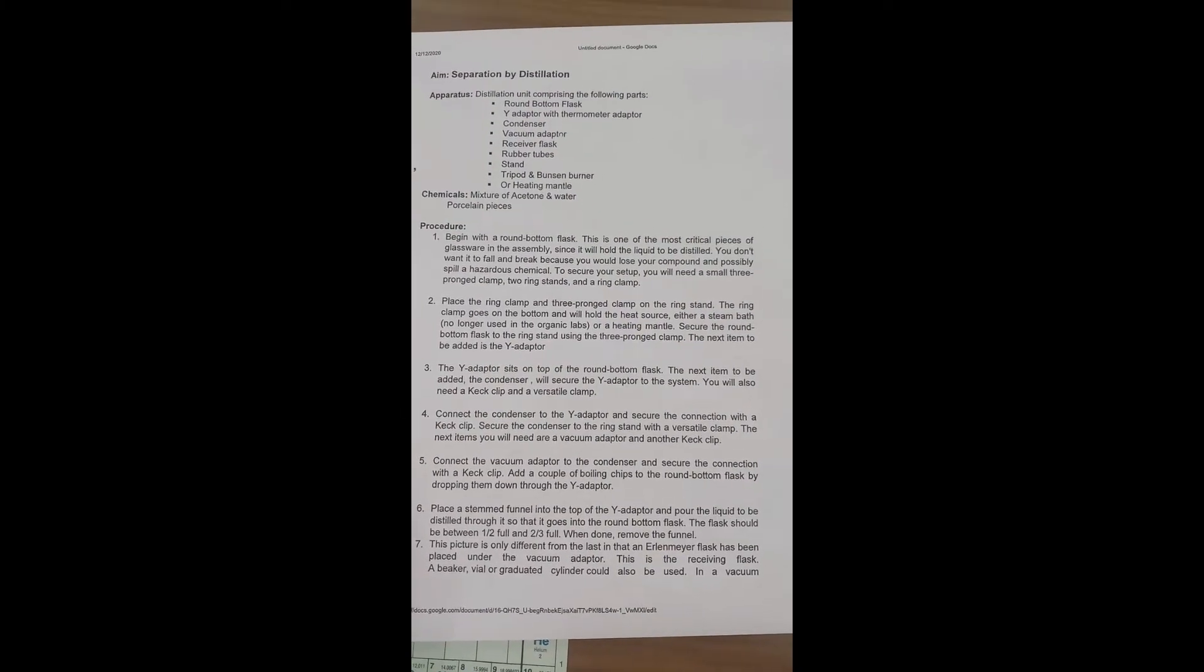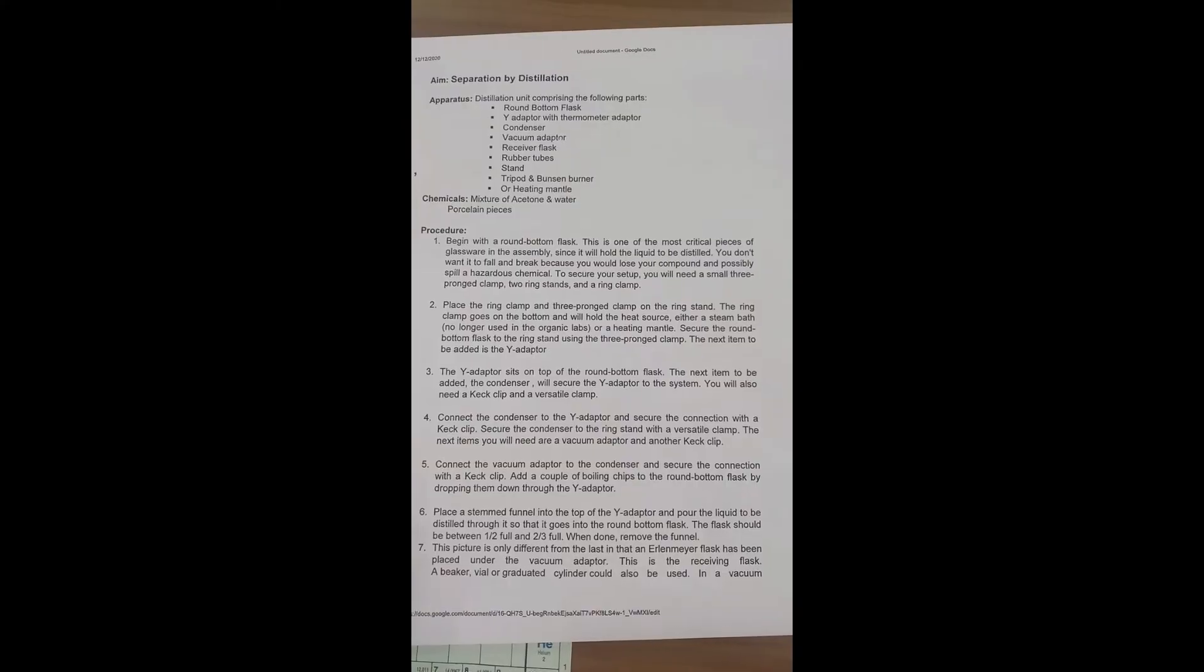Aim of the experiment: separation by distillation.